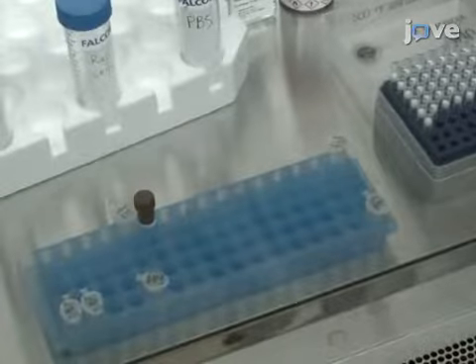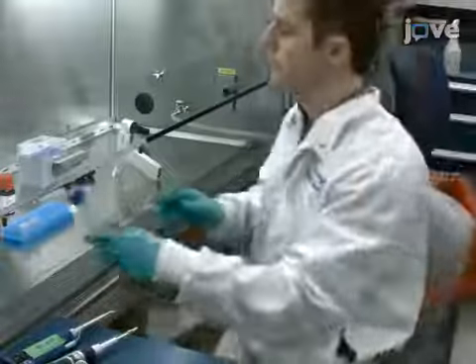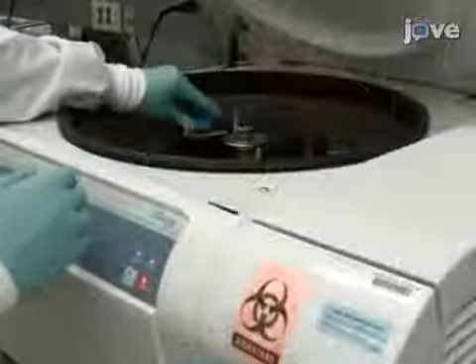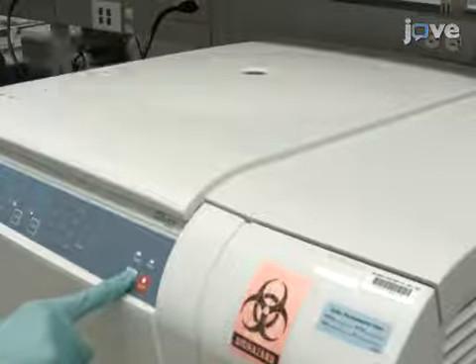Nuclear lysates will be prepared from B lymphoblastoid cells in this experiment. However, this procedure can be applied to most cell lines. After counting cells using a hemocytometer, spin down the desired number of cells for lysing.